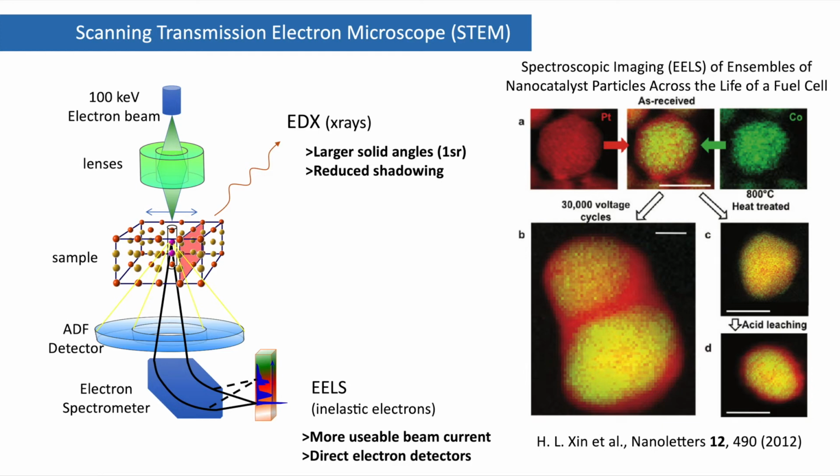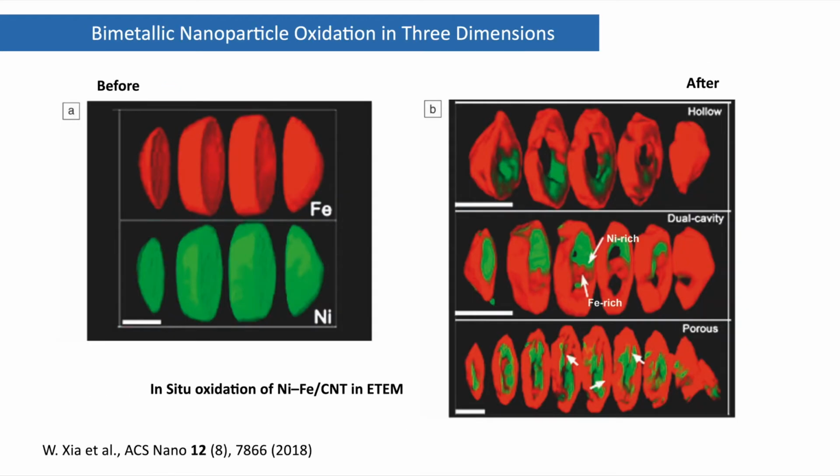So we go from A to, say, figure B, and in figure B we see 2 distinct cores that reflect the original 2 particles that existed before coalescence. So spectroscopic mapping is giving us chemical projections of specimens. And if we collect chemical projections over many projection angles, we can do chemical tomography.